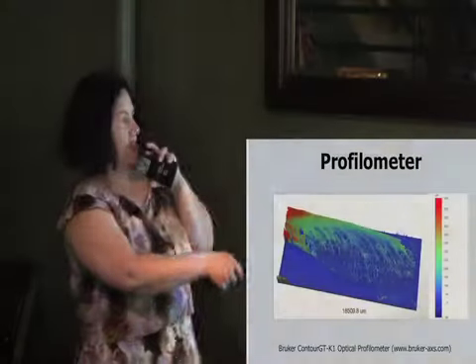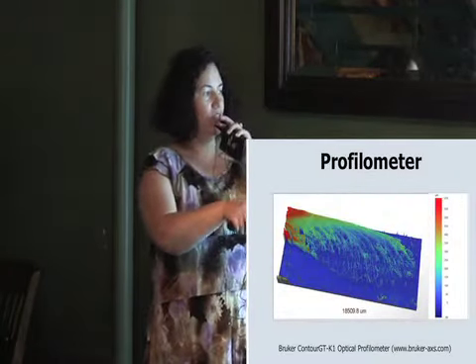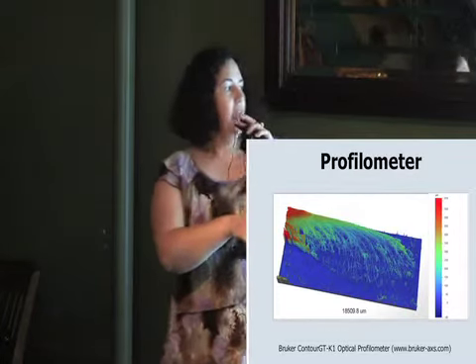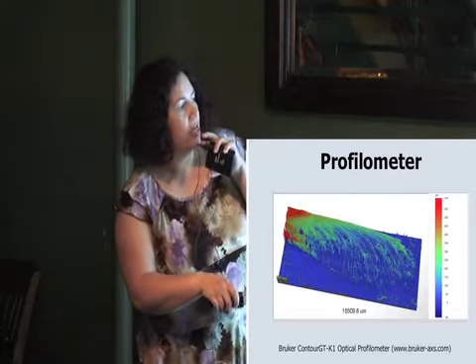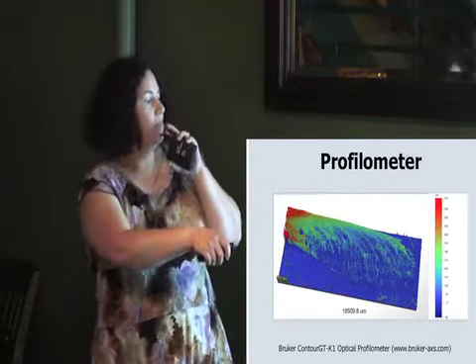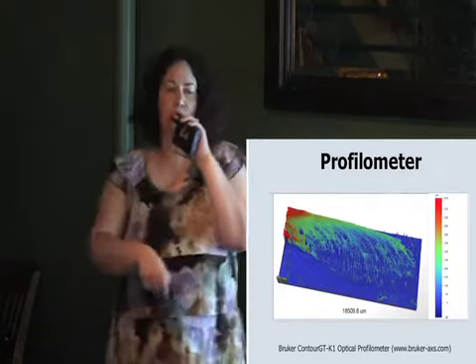And the same seed in a profilometer will look like this. So this is the full wing of that seed. The seed is here. And you can see details. They are mapped in color. We can do that with light. And here there is a scale that gives sense to this color.